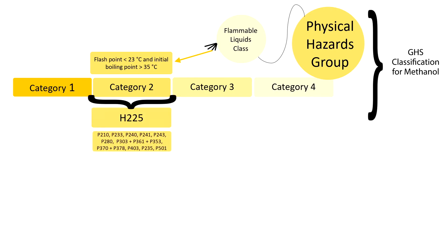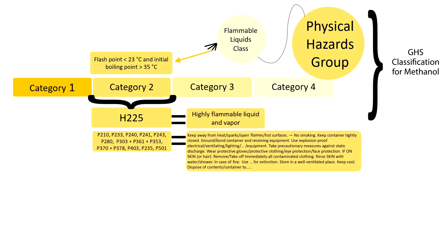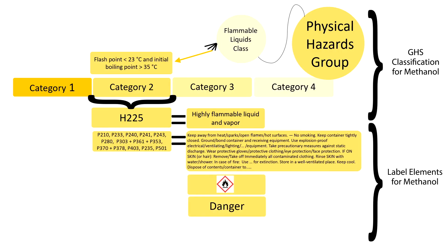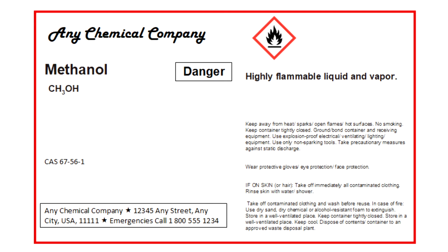Now that we have the GHS classification for methanol, this identifies the hazard and precautionary statements that must be on the label. Instead of the alphanumeric H and P codes, the full text of the statements should be on the label. The pictogram and signal word are also defined by the category and should be on the label. With the addition of manufacturer information, we now have all the label elements related to methanol's physical hazard of flammability.